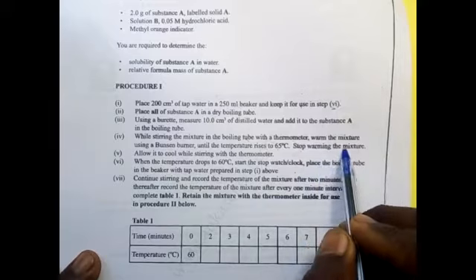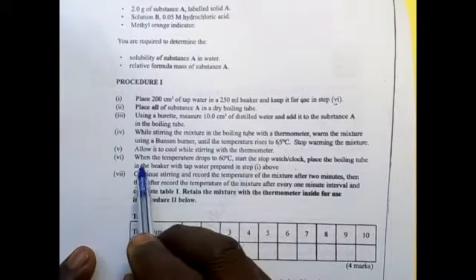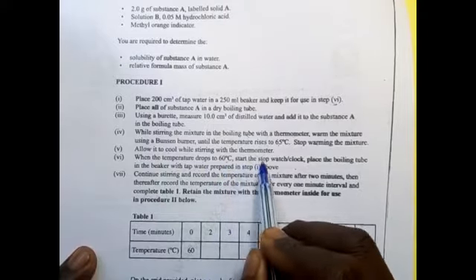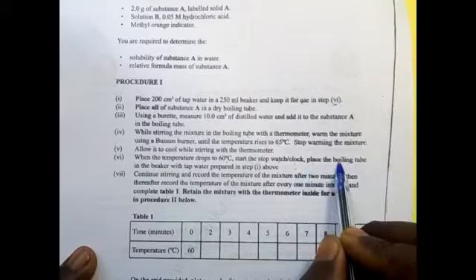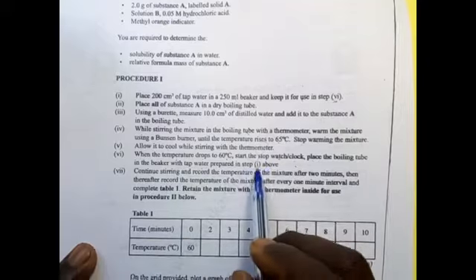Stop warming the mixture. Allow it to cool while stirring with the thermometer. When the temperature drops to 60 degrees Celsius, start the stopwatch. Place the boiling tube in the beaker with tap water prepared in step 1 above.